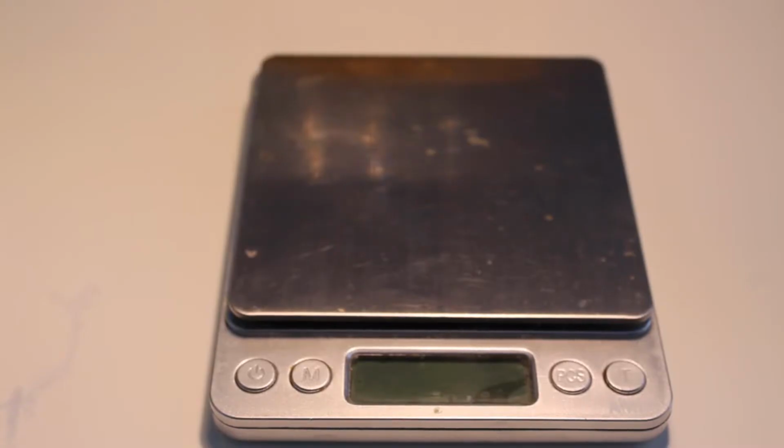Hello, this is the first chemistry video on this channel, and today we're going to be making Benedict solution. It's a solution used to detect not carbohydrates, but monosaccharides. Not in specific foods, just any food that has monosaccharides. If it has monosaccharides, you can detect it with this.